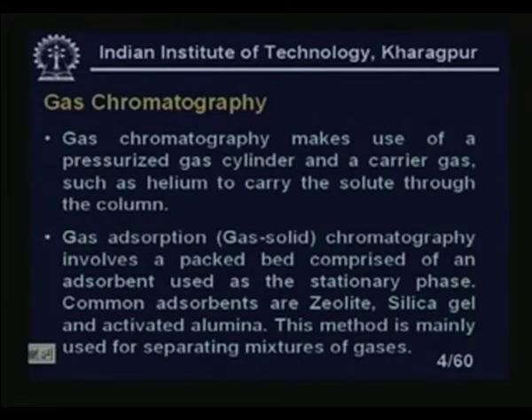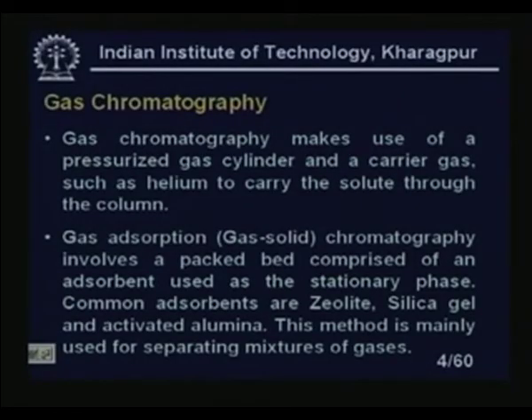Gas adsorption, that is gas-solid chromatography, involves a packed bed comprised of an adsorbent used as a stationary phase. Common adsorbents are zeolites, silica gel and activated alumina. These are the most common sorts of adsorbents used in chromatography. This method is mainly used for separating mixtures of gases.